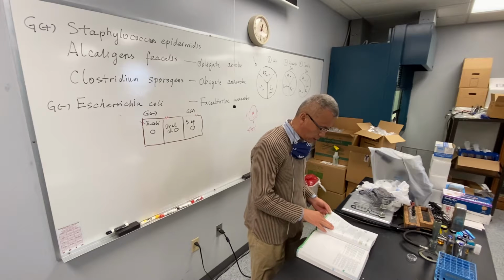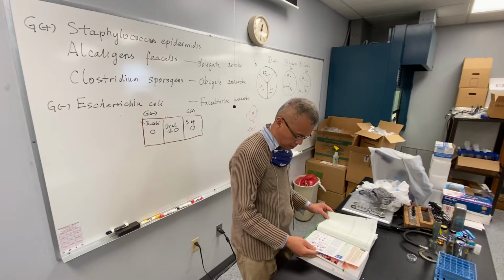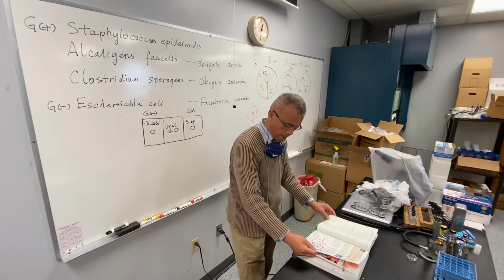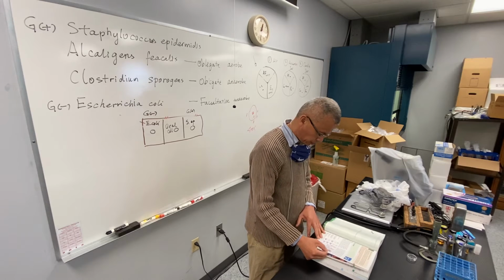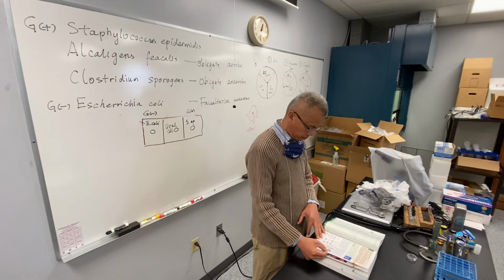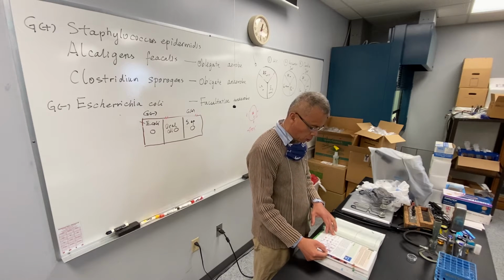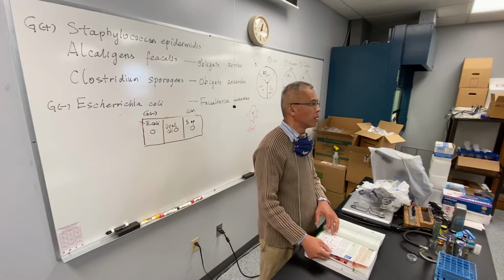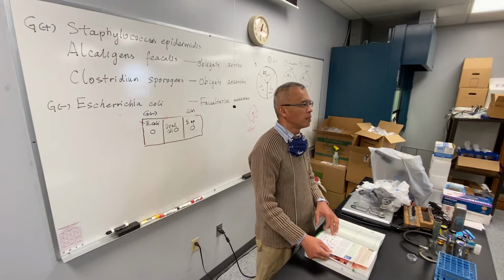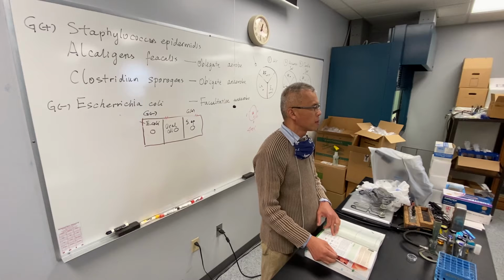Let's turn to your book for the Gram stain, chapter 37 on page 195. So we talk about the Gram stain theory, the theoretical background, right? Remember in the lecture? Anybody remind me about the Gram stain theory?